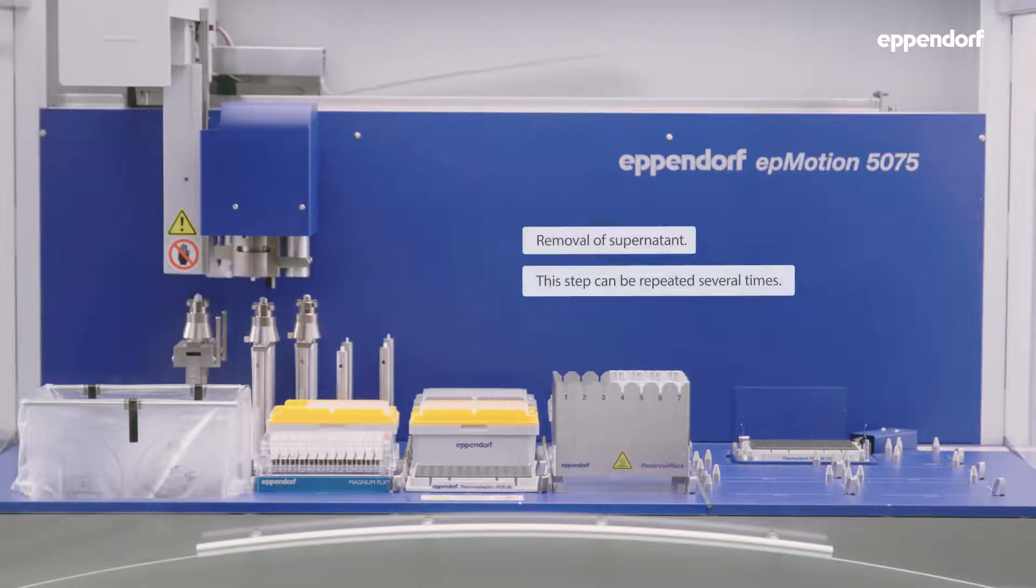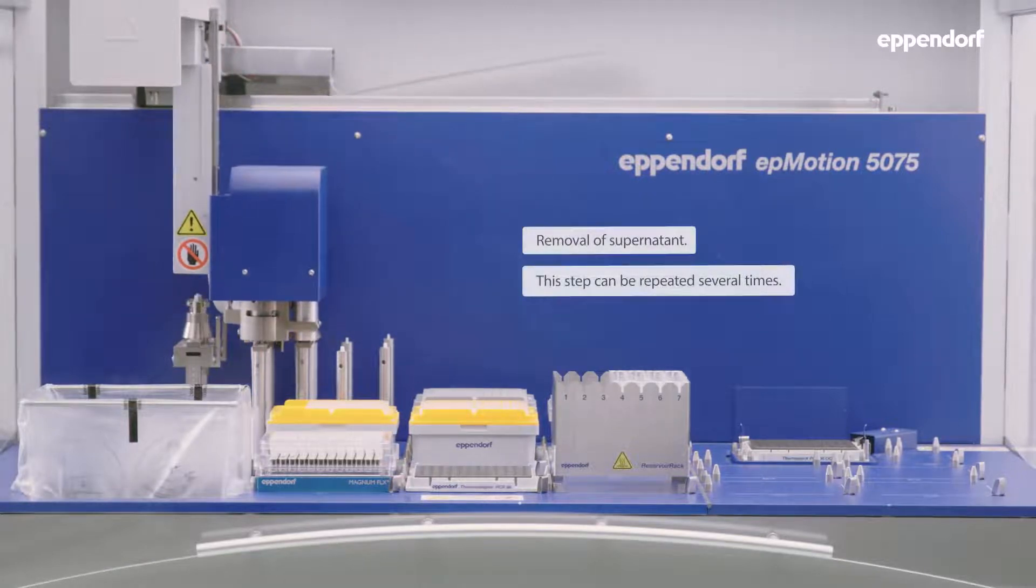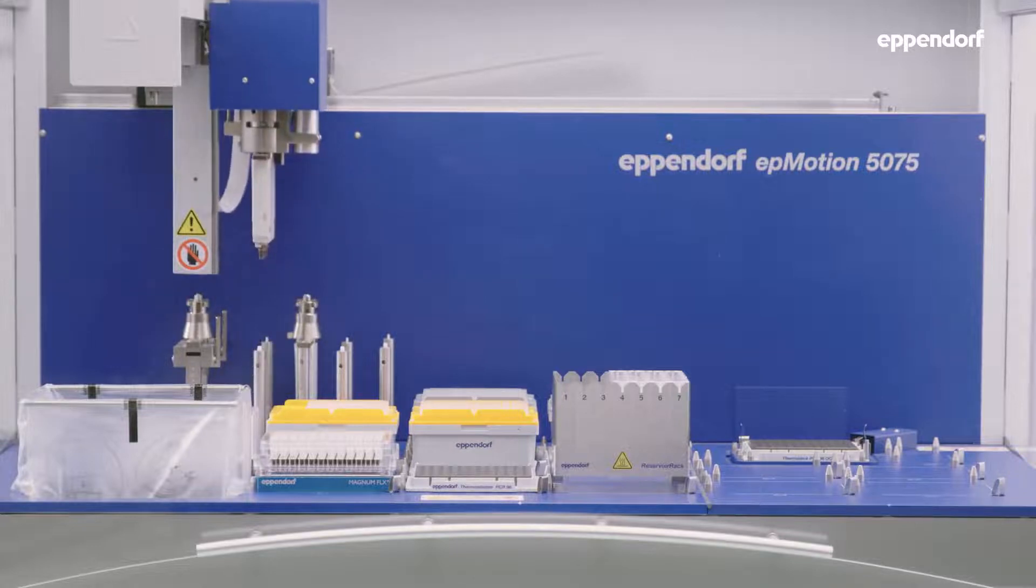After separation, the supernatant is removed to the liquid waste using a 300 µL 8-channel dispensing tool.